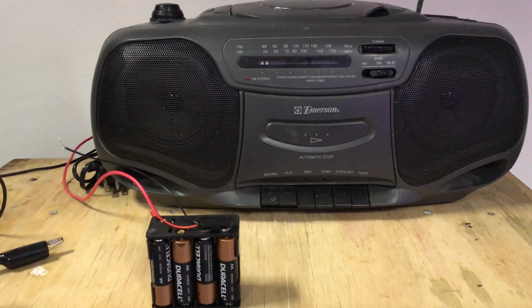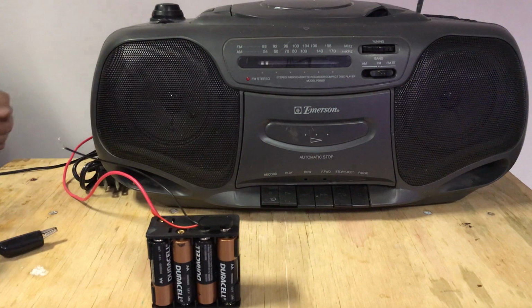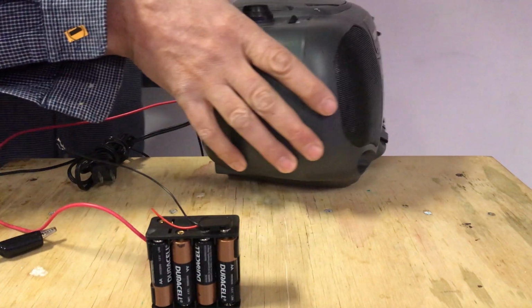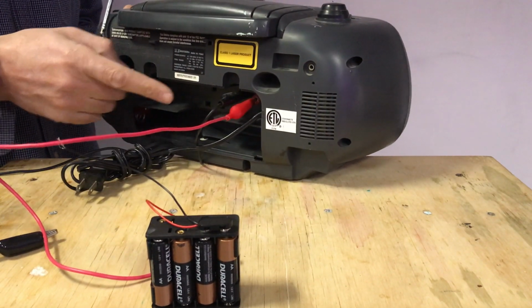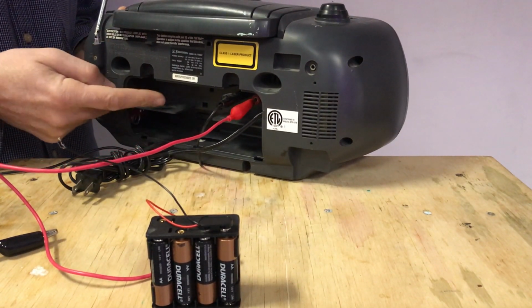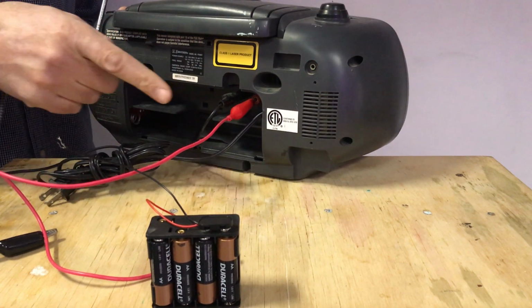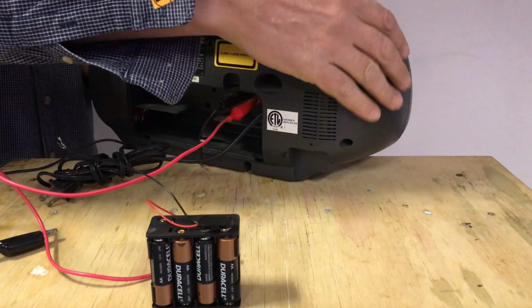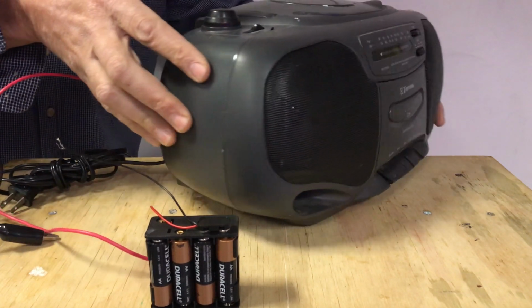So I'm going to connect the leads that go to the back of this radio. I did have a student years ago do that for me nicely to make it easier. It was Brandon McMahon. And so again, that's where the C battery is connected. You can see the cord here connects. And all I'm going to do is run the leads from the positive and negative end of where the batteries go. And I'm running it into this brick, this 8 AA brick.